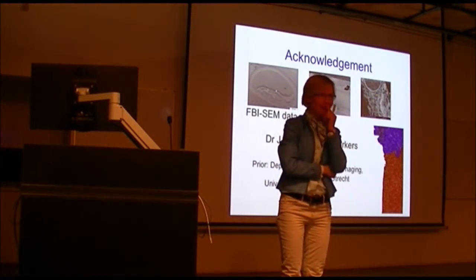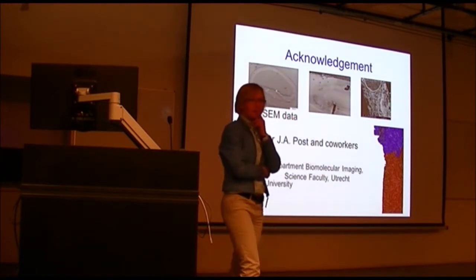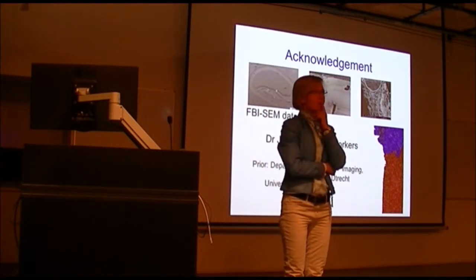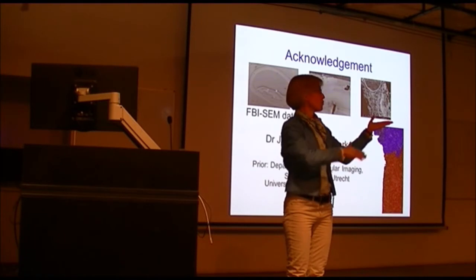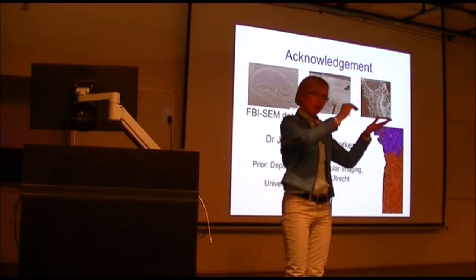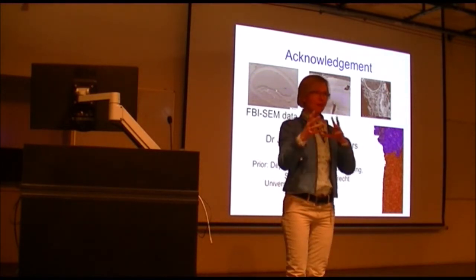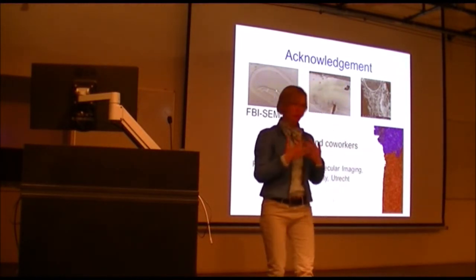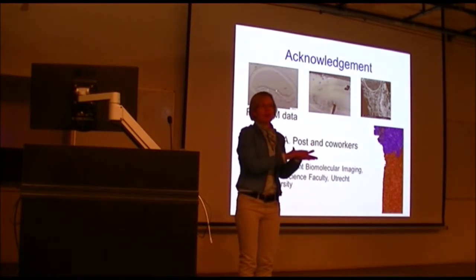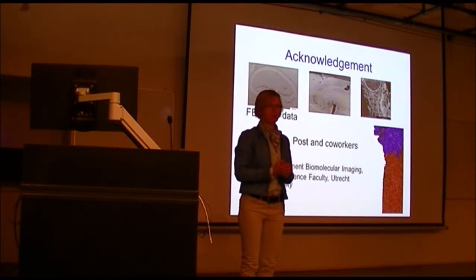If you do the part where you take up the slides and make it 3D, how much time does that take? If you, for instance, need a centimeter of tissue, how much time does the machine need? I don't know that answer. I think it's relatively fast, because the process of beaming away something with these ions, that's more or less how fast the slides go. So once you have the preparation ready, you can do that in a couple of hours, let's say. To get a tissue in a situation that you can look at takes 3 weeks.